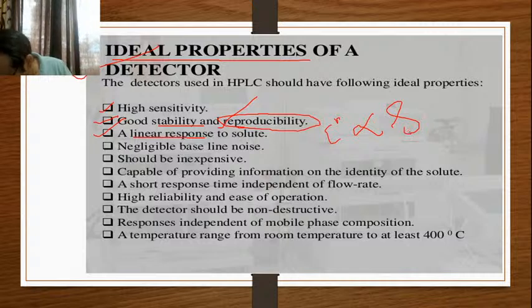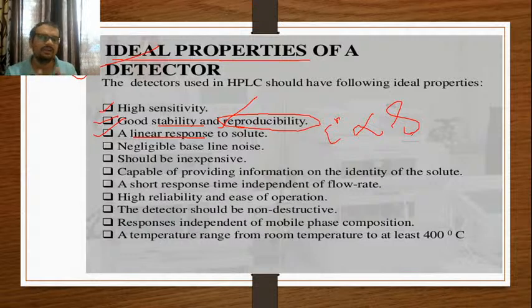Yes, emission of the light by a substance that has absorbed the light or other electromagnetic radiation is what Deepak Shukla says. Good. Yes, emission of light, because it is emission spectroscopy. Good. Okay, now linear response, negligible baseline noise.